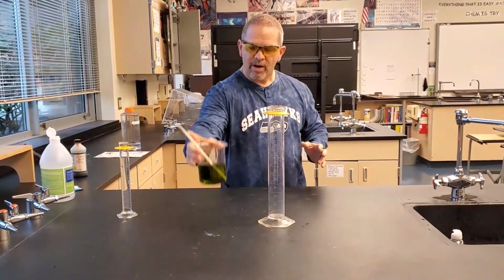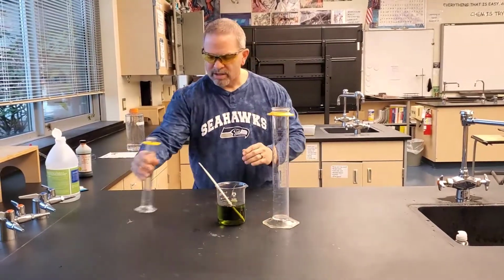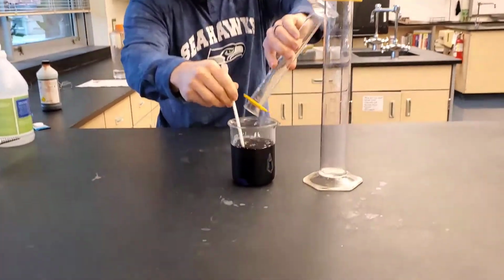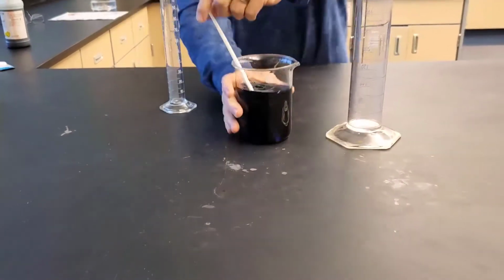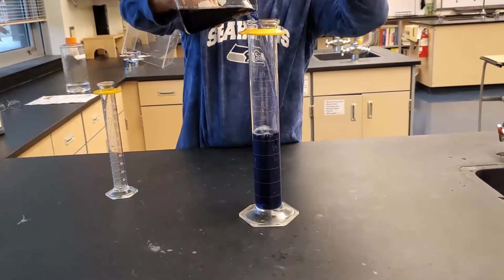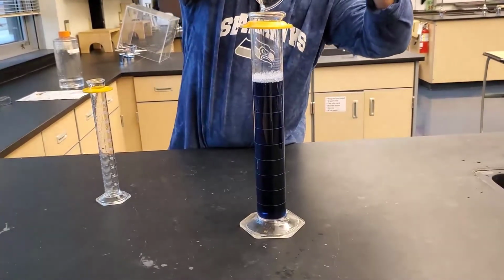So you can see right here, I have this kind of green solution. And I'm going to pour in some sodium hydroxide, and you can watch what's going to happen. Now, it's going to look really dark to you, but it's going to be a really pretty purple. And I'll show you that by pouring it in this large graduated cylinder. There you go. Kind of a bluish purple. So we got a color change there.